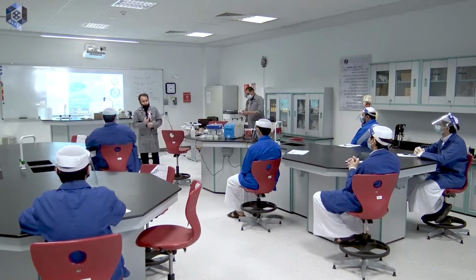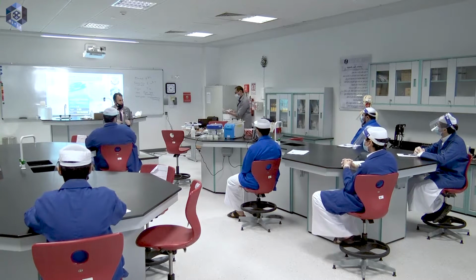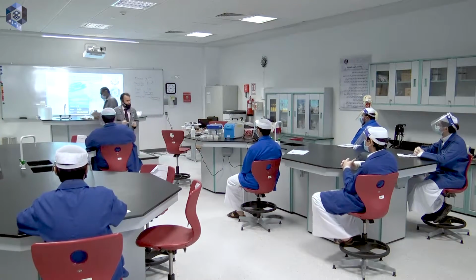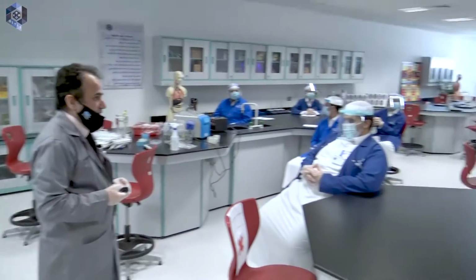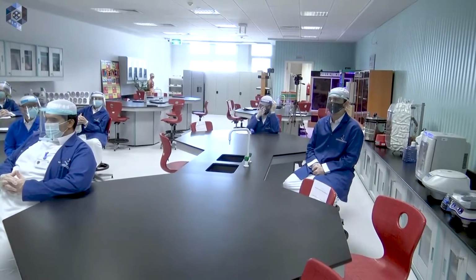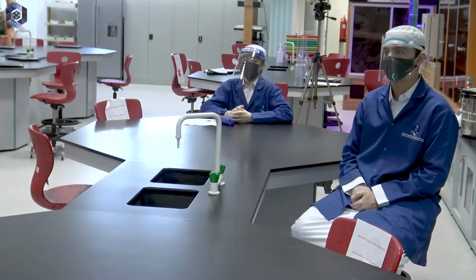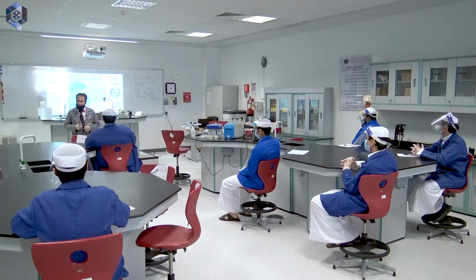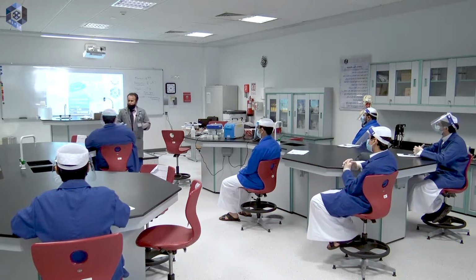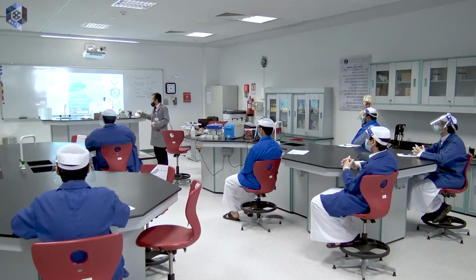Gene. Can you name exactly the gene that we are going to clone in this experiment? The gene for kanamycin, the kanamycin gene. What is kanamycin, Tariq? Do you know kanamycin, Nassar? Is it something we eat? Well, kanamycin is the same as ampicillin, streptomycin. Do these names tell you something, remind you about something? Yes, antibiotic. Kanamycin is an antibiotic, ya Nassar. Now, this is the overall experiment we are going to do.